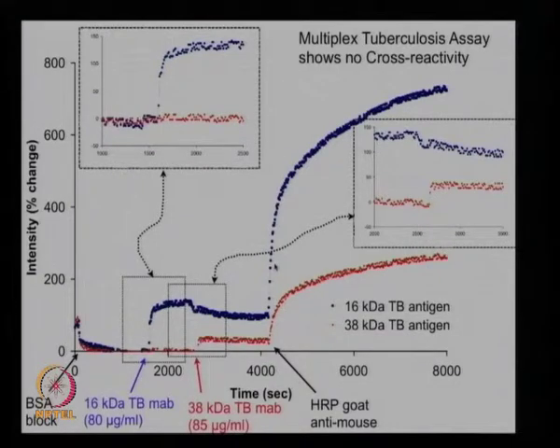If we see the signal of both, then I think we know that person is actually positive for that. Well, TB is a very hard thing to detect. But at least now you know that you have two signs. It's there, and you can imagine adding other potential markers for TB, and so you get more and more sure that something is actually happening.